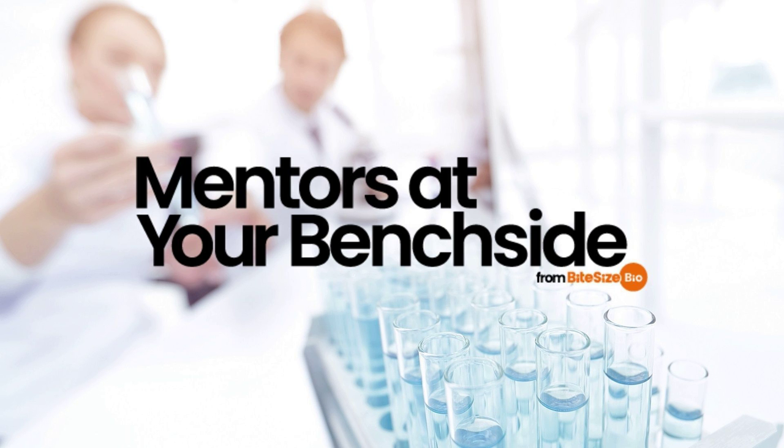A word of caution. Phenol is a toxic chemical that is poisonous and corrosive. It can rapidly cause severe burns and should be handled with extreme care. Because of the dangers of phenol, consideration of alternative methods should be given. Salting out is one method for DNA extraction that avoids the use of hazardous reagents like phenol. But for now, that's it for how DNA extraction using phenol works.